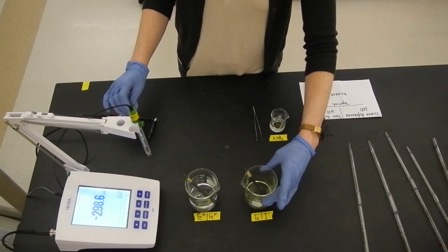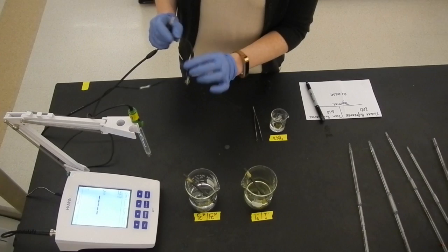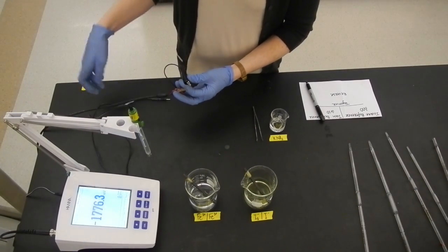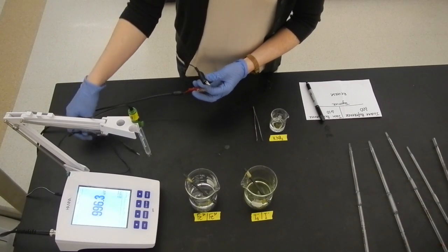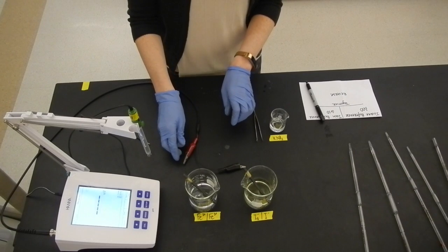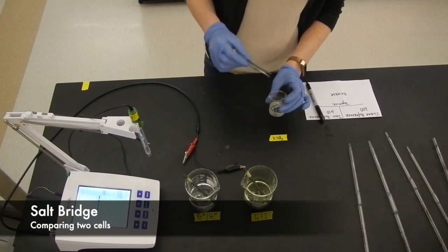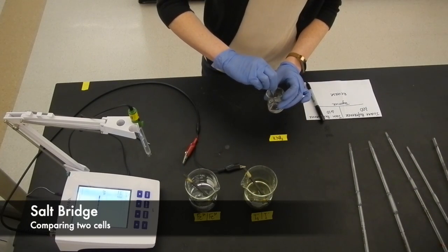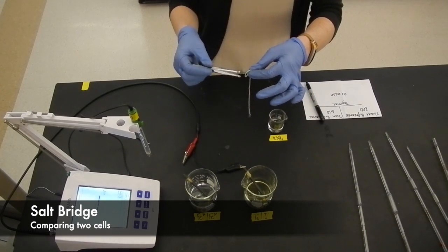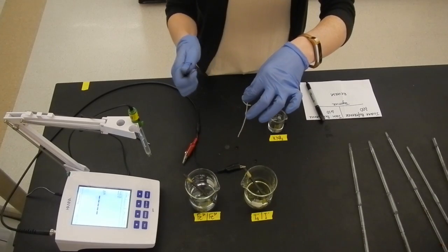Now, we will disconnect the alligator clips for the voltmeter from the reference electrode. Consider what you think will happen when the iron and iodine half reactions are combined into a new electrochemical cell. To complete the circuit between the two half reactions, we need to place a salt bridge between the reaction beakers.